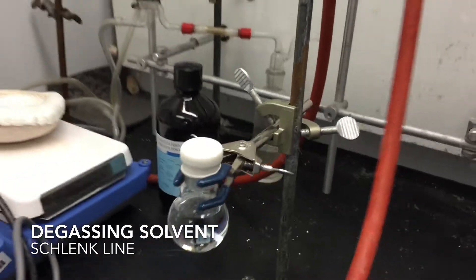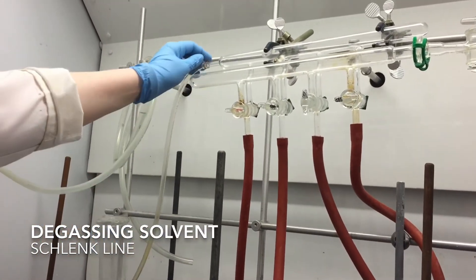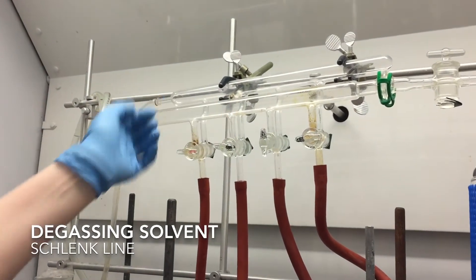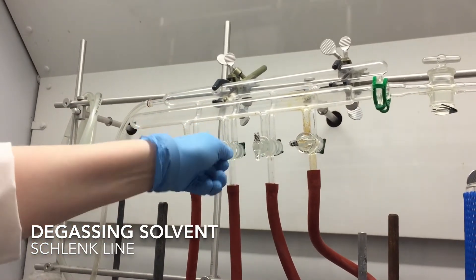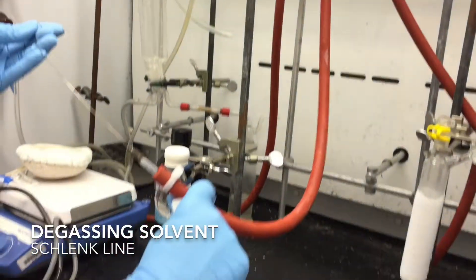We're going to open up the tap to nitrogen. The nitrogen is flowing in through this tubing here to the back, which means that when I open up my tap, I want the tap to line up to the back part of the schlenk line — so in that case, it's this way for me. Now we have nitrogen flowing out through this tubing out of this needle.